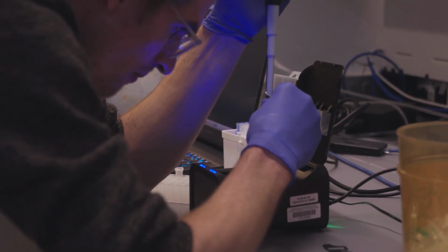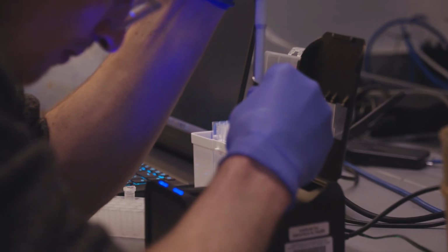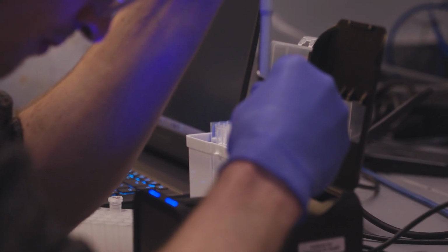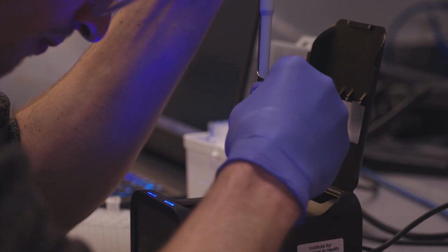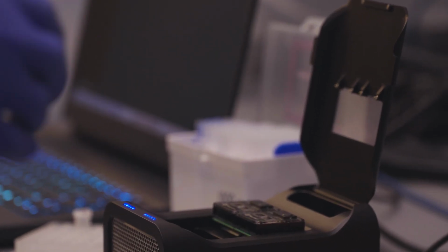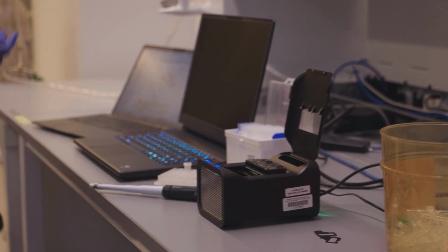You can push it, but for me, I don't have that much control. Sometimes by chance, if the thumb comes up, then you are creating a reverse pressure, right? And I don't want to do that, so I make sure I don't. You worry about the bubble. Yeah, that's why I do it this way. I feel more comfortable this way. Some people just don't like it, they use the other way, and that's fine.